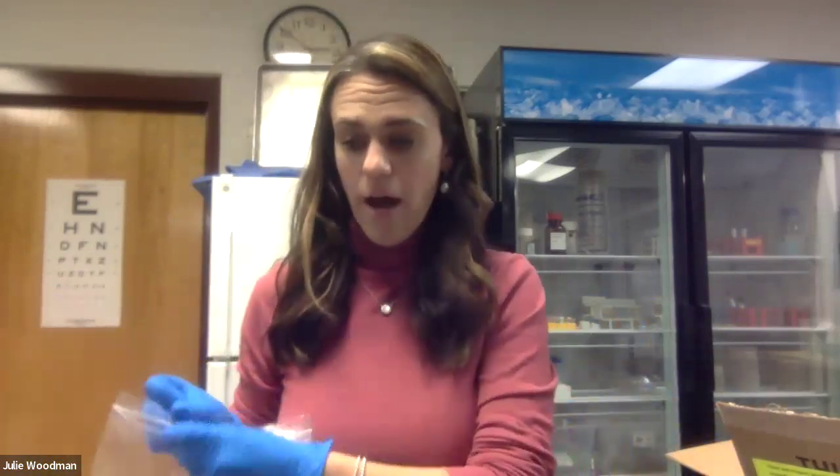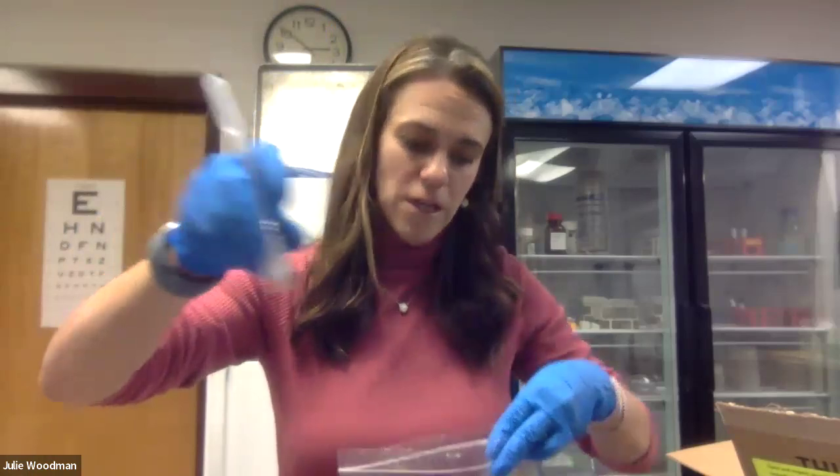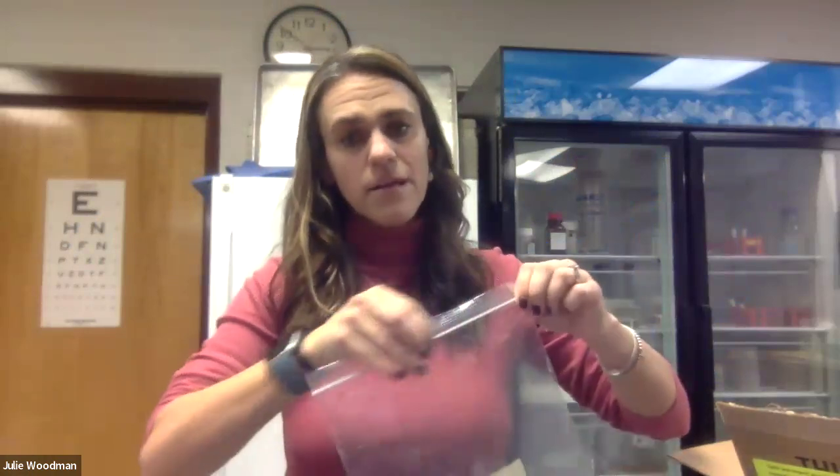Once you are done resuspending all of your bacteria, you're done with lab work for the day and just need to clean up. A good way to dispose of all used materials like the transfer pipette and the culture vial is to put them in a plastic bag. Add your gloves when you take them off — loop them into each other, put them in the bag, seal it, and that's trash. As a final step, wipe down your working surface so it's clean for future activities. That's Day 1: get your bacteria growing, and they'll sit and grow for a few days before further experimentation.